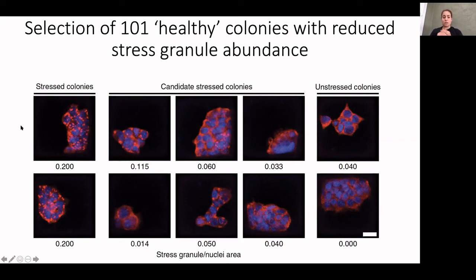But that is a really interesting question, because there are a lot of studies trying to figure out how these granules may be fused together, or what is essentially nucleating stress granules versus allowing them to continue to grow and get bigger in the cytoplasm. So those are really interesting questions that we're interested in addressing, but we didn't capture them at the imaging resolution that we chose to use here. Right, if I were to do that again, I would go with a higher resolution and then maybe fewer guide RNAs in the screen to be able to maintain the coverage.